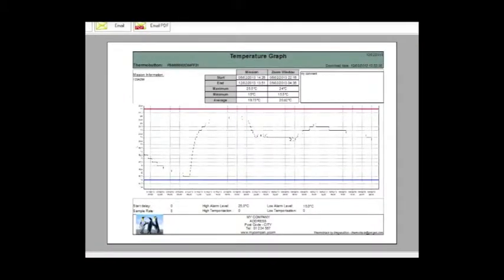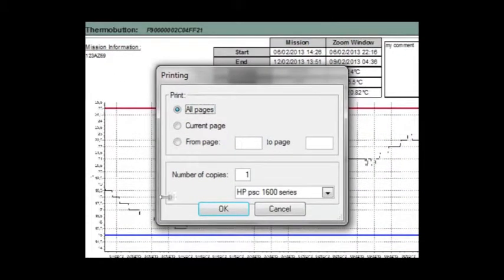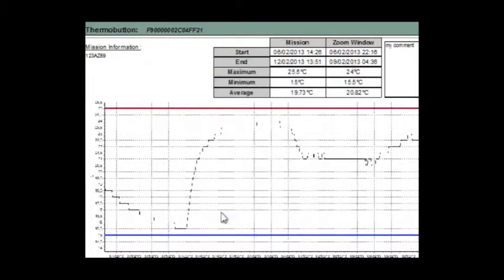This is the preview of the report. You can also send the graph by email and PDF.